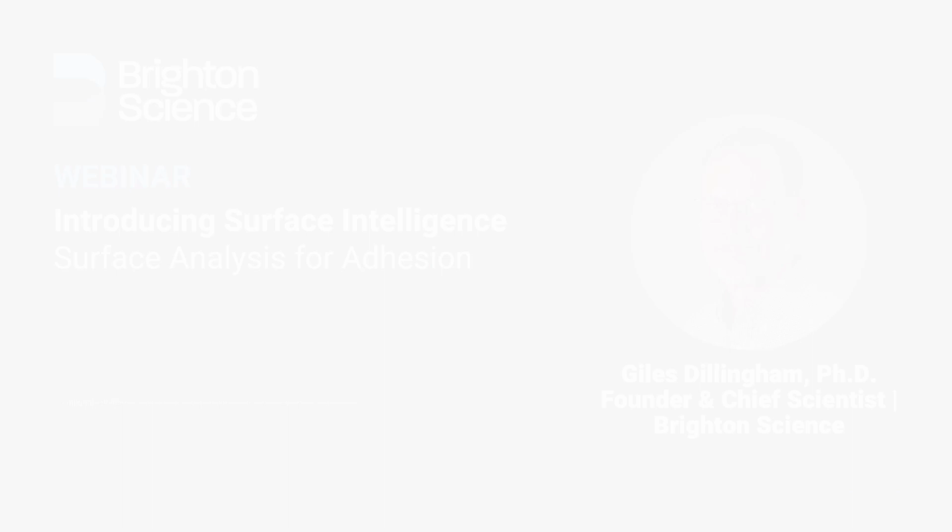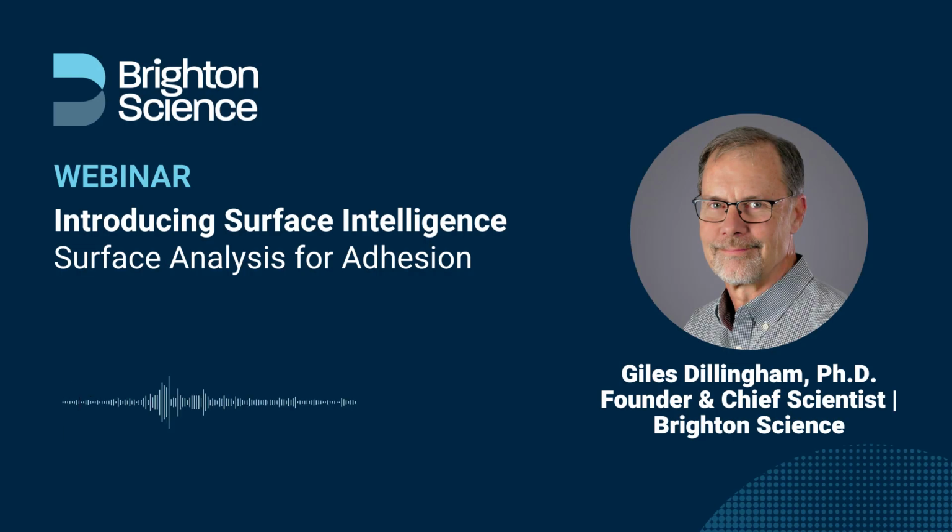X-ray photoelectron spectroscopy gives us monolayer sensitivity to atomic composition. It also gives us a lot of molecular structural information, and it's an indispensable tool for understanding surface structure, surface treatments, contamination, and doing failure analysis. But it's really a laboratory technique, right? It's not something that we can readily use day to day for controlling processes, right?